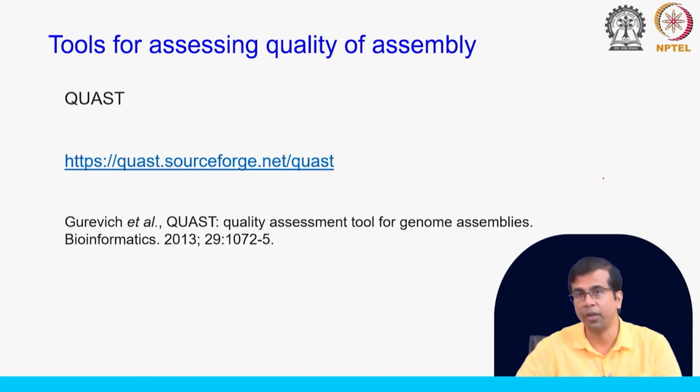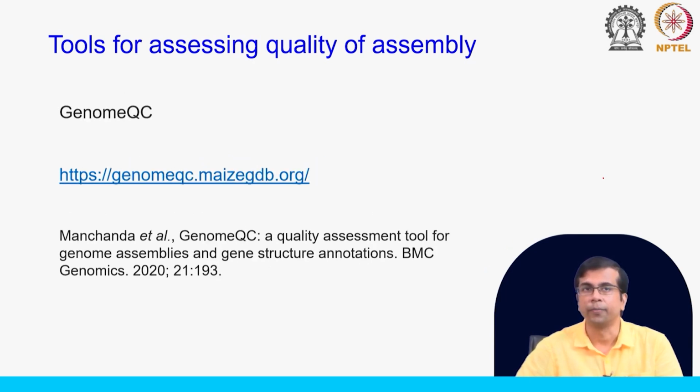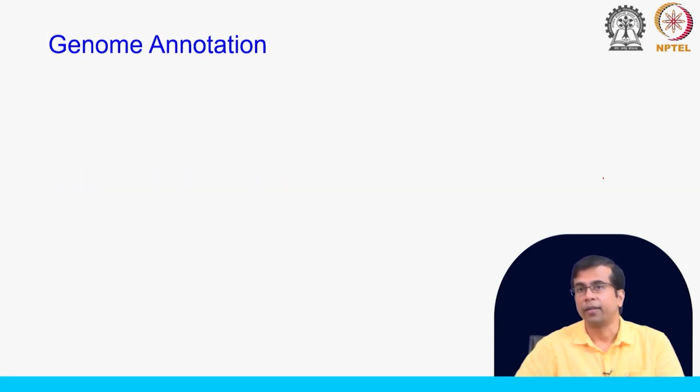Again, I will just simply mention these tools. Again, you can find the links, and you can also go through the papers, and you can utilize them for your research. Finally, the final step after you have checked the quality is something called genome annotation.